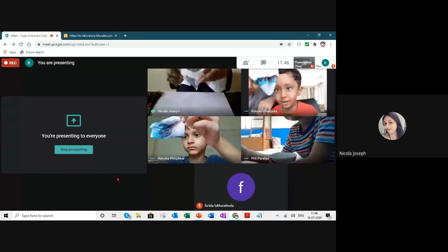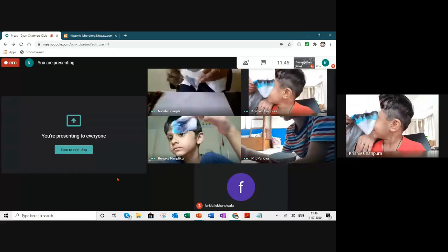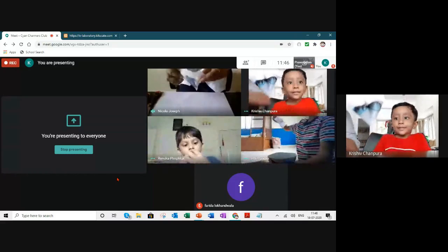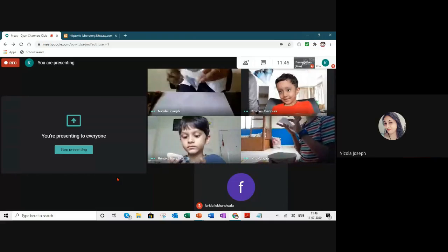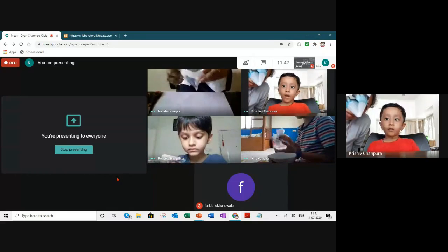Yes or no? The black sketch pen, how many colors does it have? You can see? All of you see your own paper? Has it changed color? Yes. Yes. It has three colors. Okay.